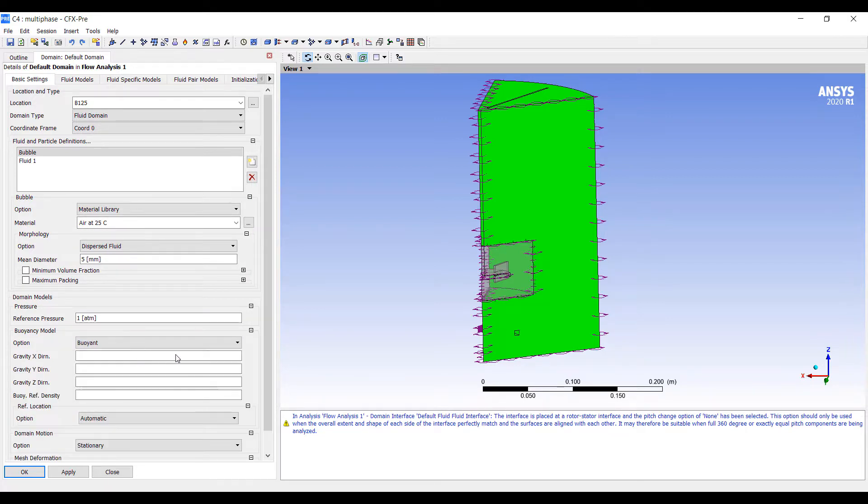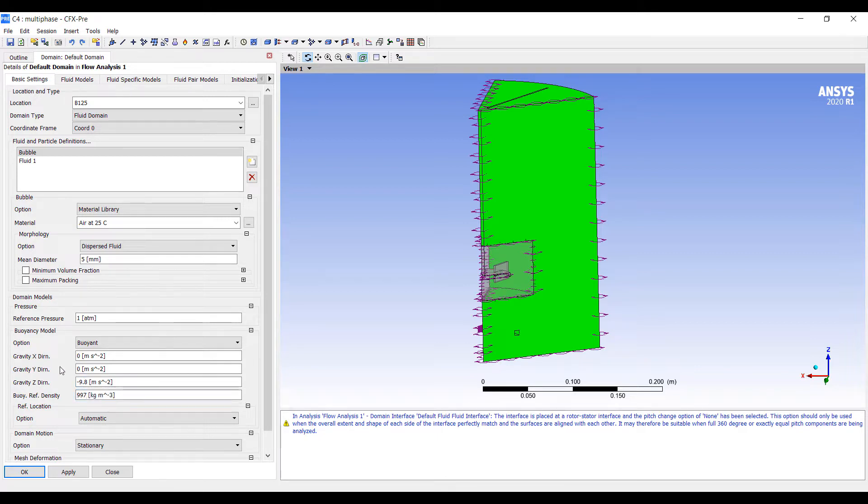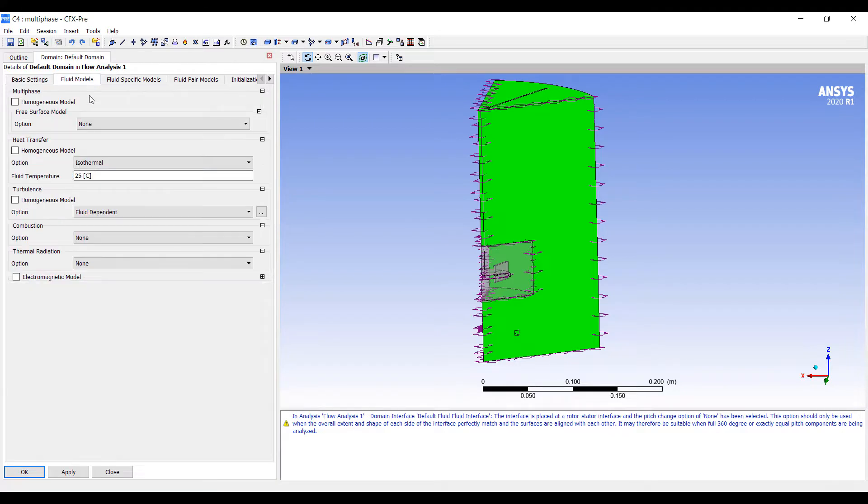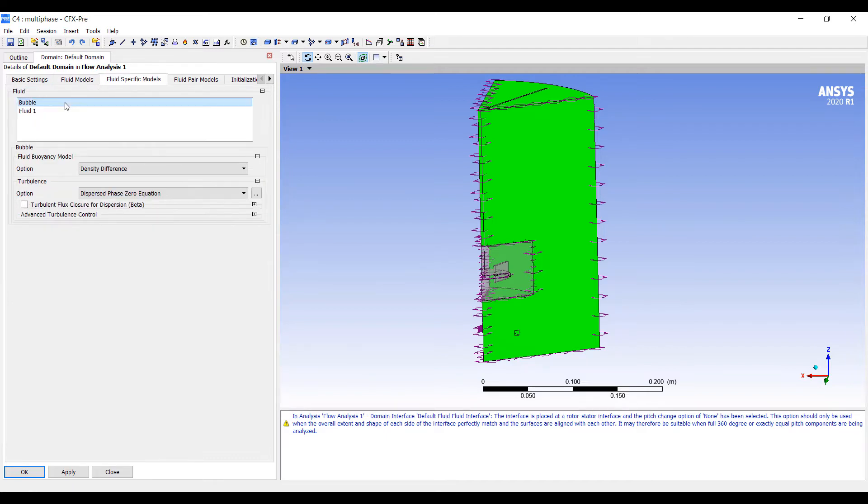We are going to turn on the buoyancy model. The direction of gravity is in the minus z direction, and the buoyancy reference density will be the density of water, 997 kilograms per meter cubed. We're going to use an inhomogeneous model. There's a fluid-dependent turbulence model. For fluid specifics, we'll use the scalable k-epsilon model.